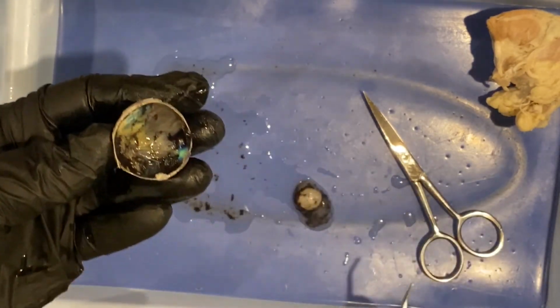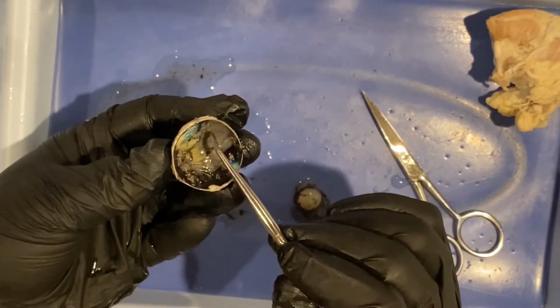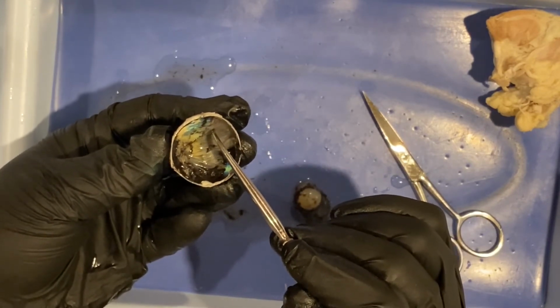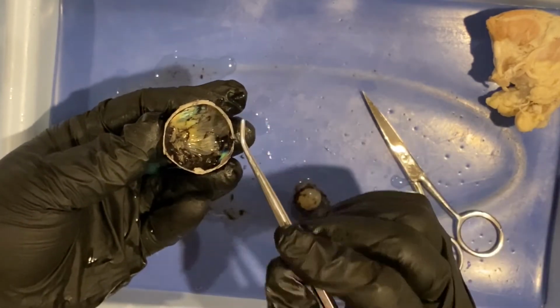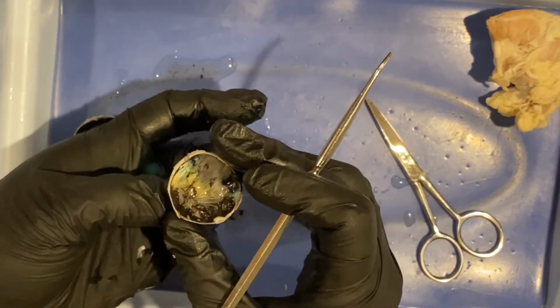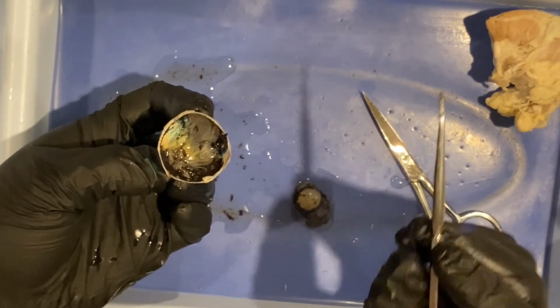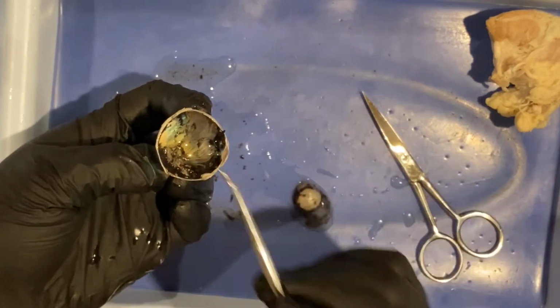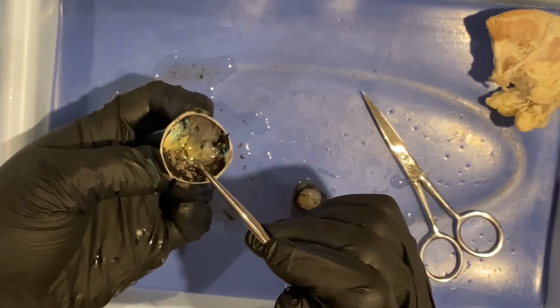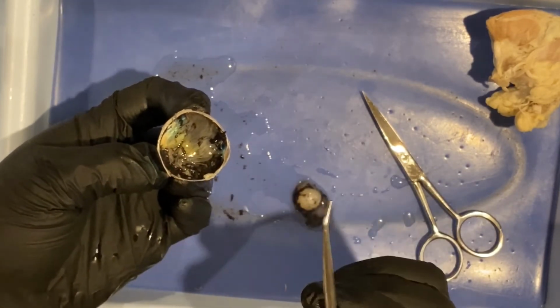So before we get into that choroid anymore, I want to make sure that you can see this sort of beige tissue that looks a little bit wrinkled. This is part of the inner tunic referred to as the neural tunic, and this is where the photoreceptors are found. Now, the photoreceptors are rods and cones. Cones help with color vision, rods help with night vision, and there are a lot of densely packed cones in an area called the fovea centralis, which would line up directly with the pupil.